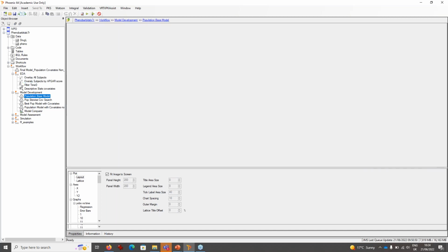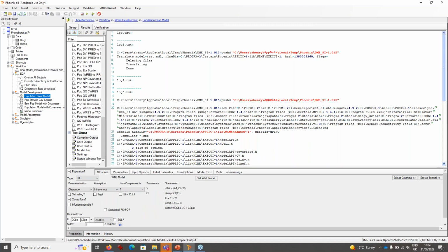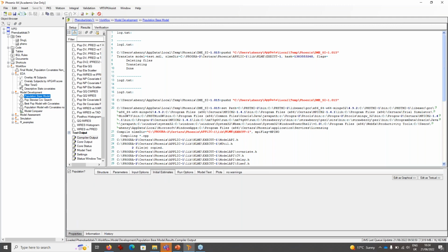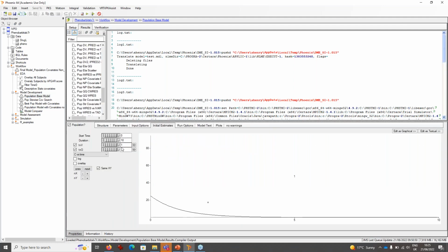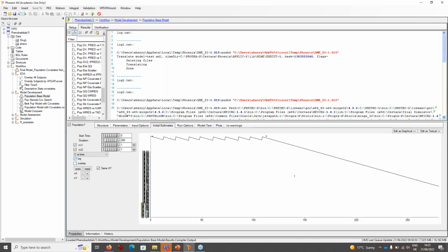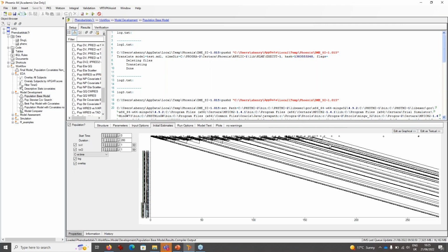We've got a base model. And in this base model, we've started with a IV 1 compartment model. And that means that when we look under the initial estimates tab, just build up in a moment. And I say I want to, this data ran for about 280 hours, okay? So you can see there's my loading dose and there's my maintenance dose. Let's look at that log, make it a bit more informative. It looks to be roughly in the right order for that individual. Let's see all of the individuals. So click overlay and we can see that's more or less where I want to be.